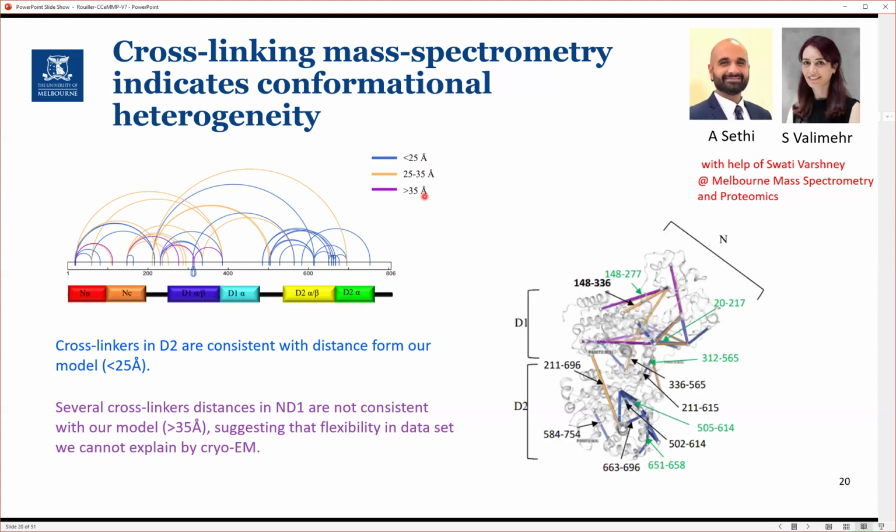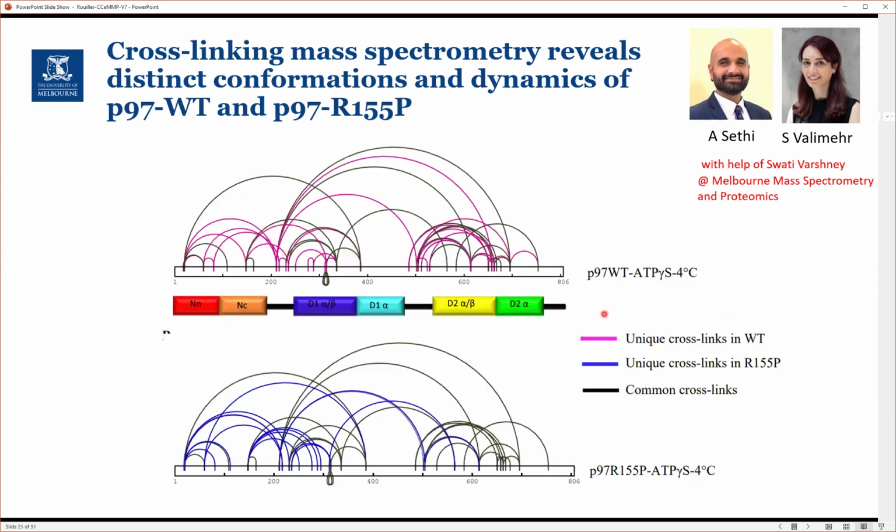And so what you can also do with cross-linking data is plot residues that are interacting with one another on the 3D structure. So she plotted this on both the upward conformation and the coplanar conformation, and showed that some really interacting residues were far apart in the structure.